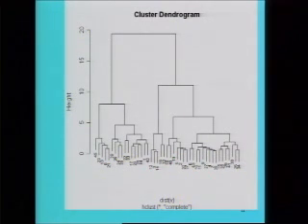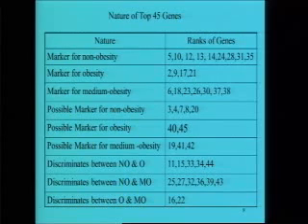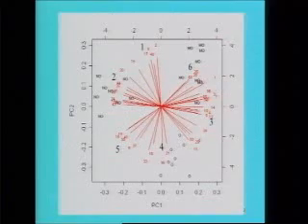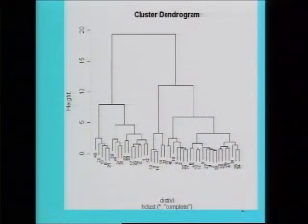Let's look at this first group, rank 45, 23, 13, 8 and 12, these form one group. And if we go to our table, these 2, 9, 15, 17, 40 are in one group, and more or less they are there. No, sorry, I am wrong. Where is that? 2, 9, 2 is here. So one can read this carefully, and again there are 6 groups visible here also.